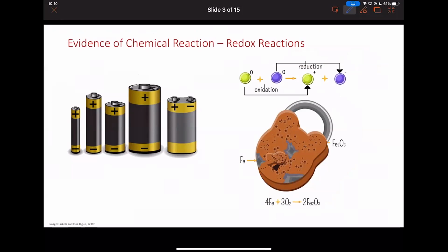So here we have the chemical reaction that we're going to talk about this week is single replacement reactions. And these single replacement reactions can also be called single displacement. And what is replaced, what is displaced, is that one metal will replace another metal.